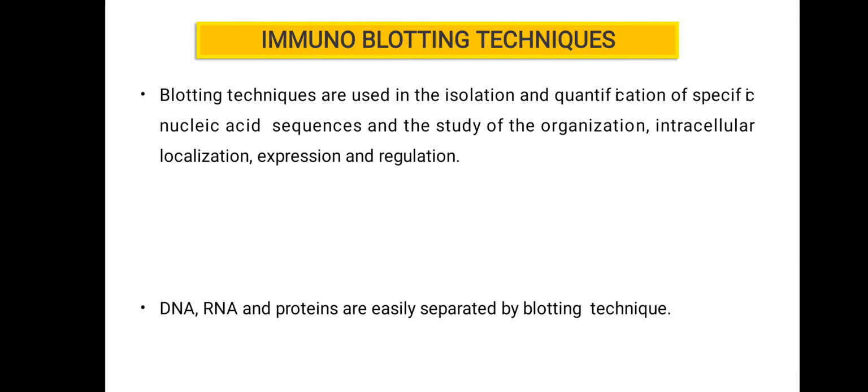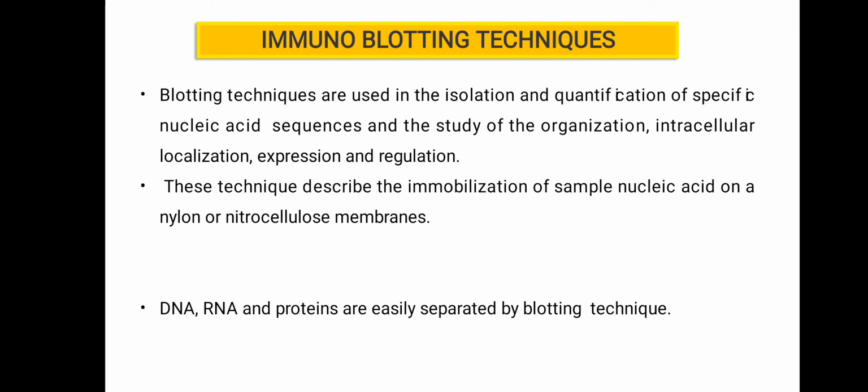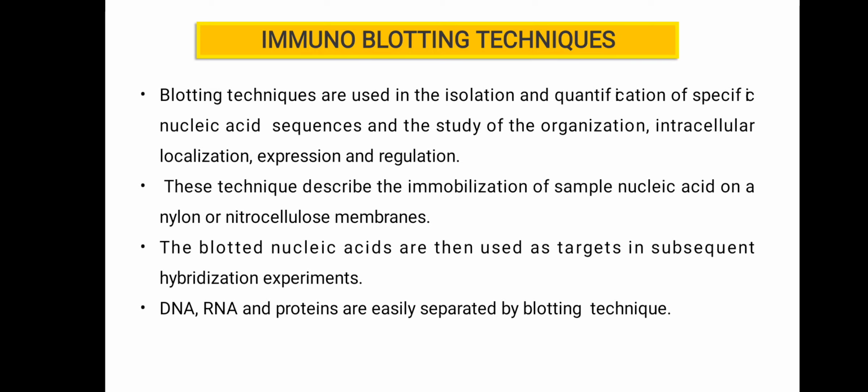Blotting techniques are the isolation and quantification of specific nucleic acid sequences, and the study of organization, intracellular localization, expression and regulation. Blotting techniques describe immobilization of sample nucleic acid on a nylon or nitrocellulose membrane. The nucleic acid is then used as a target in a subsequent hybridization experiment. DNA, RNA, and proteins are easily separated by blotting techniques.